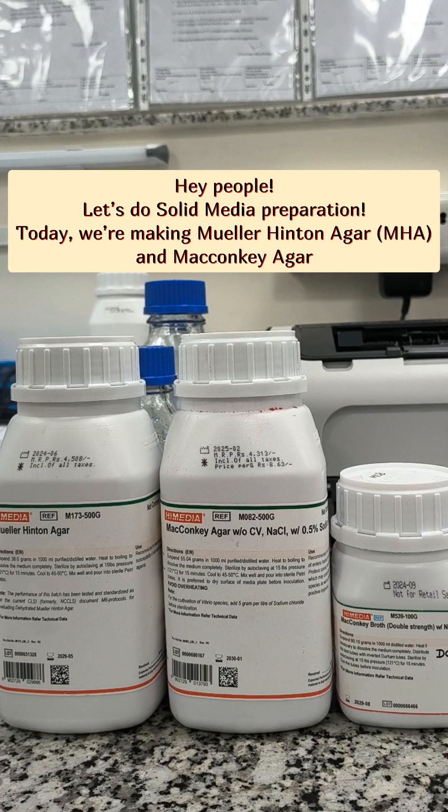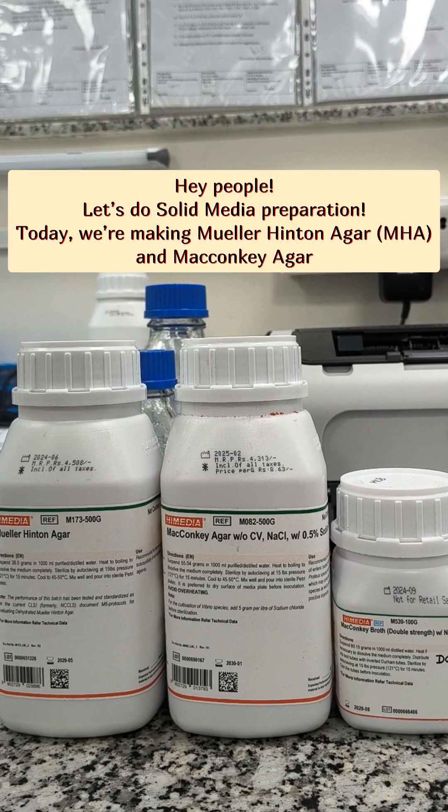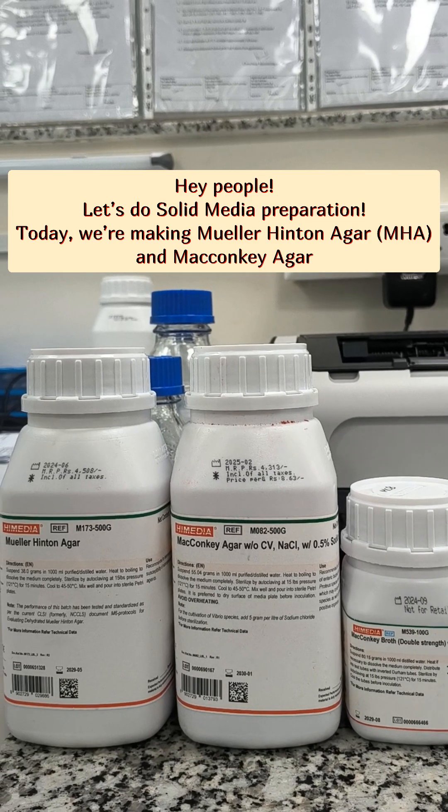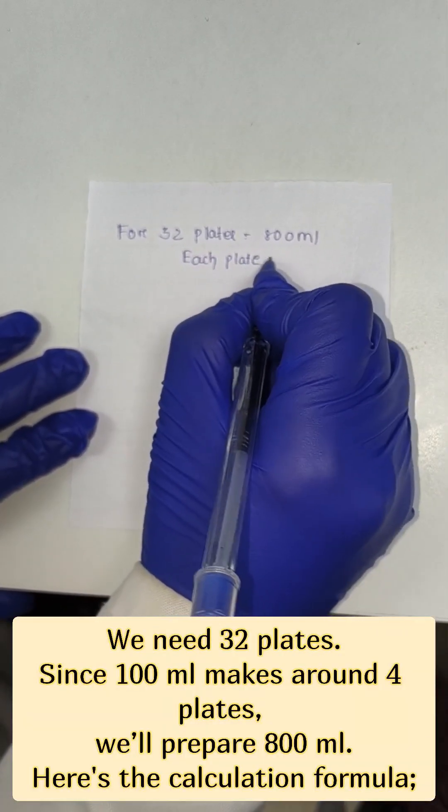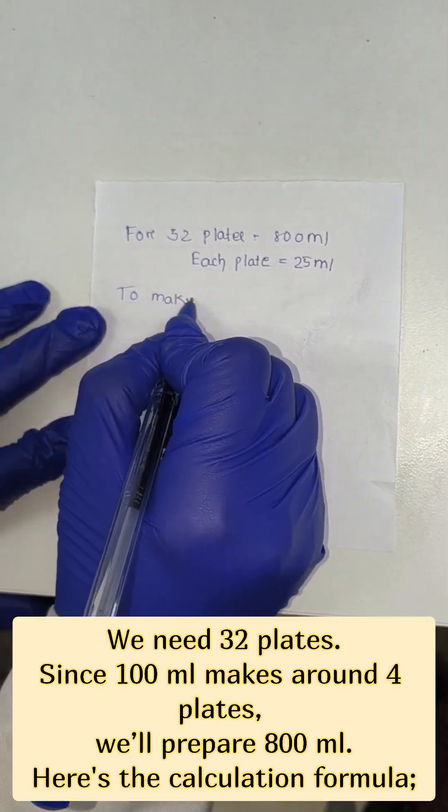Hello people, let's do solid media preparation. Today we are making Mueller Hinton agar, MHA, and MacConkey agar. We need 32 petri plates. Since 100 ml makes around 4 plates, we will prepare 800 ml.